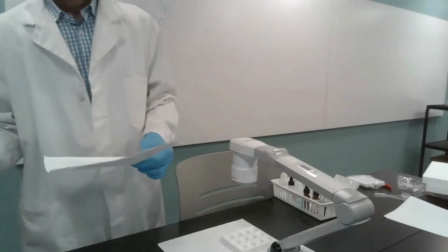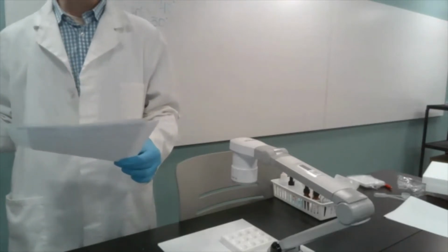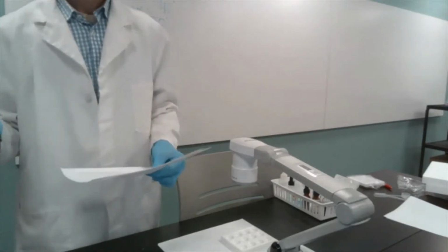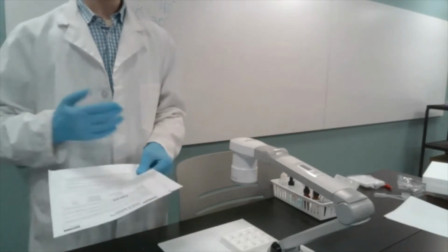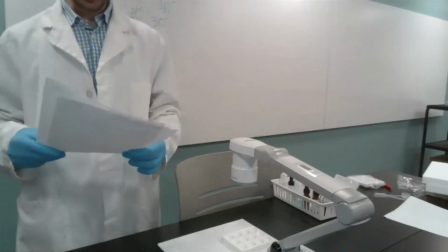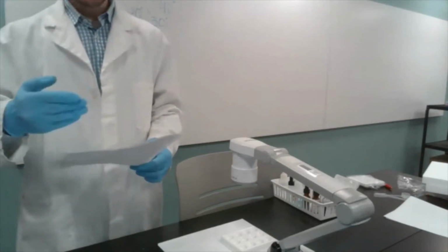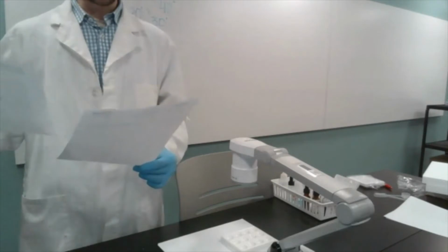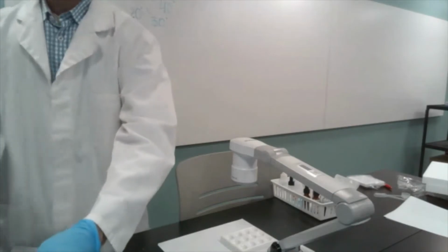And what is the goal or task that we have in this lab? Well, it's basically to determine, using some indicators, whether a variety of solutions, some of which may be familiar to you, are acidic, basic, or neutral. That is, we're not just guessing here, although we're going to make a prediction. You already probably have made it. If not, you can do it later. And we're going to test that prediction and see whether your prediction was correct or not. So we're going to draw some kind of a conclusion as well.